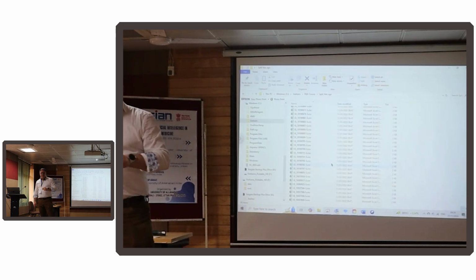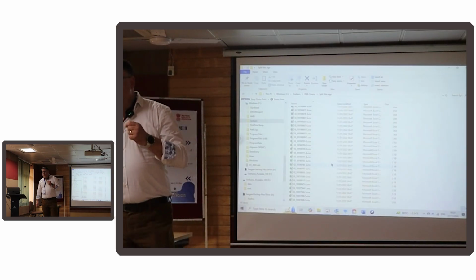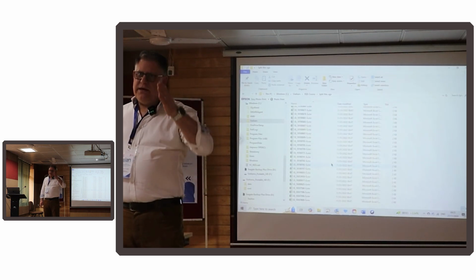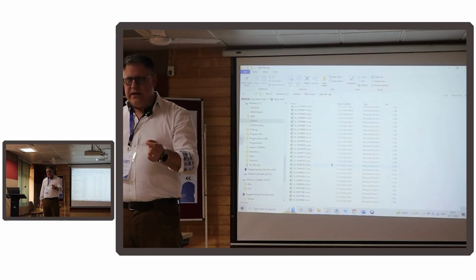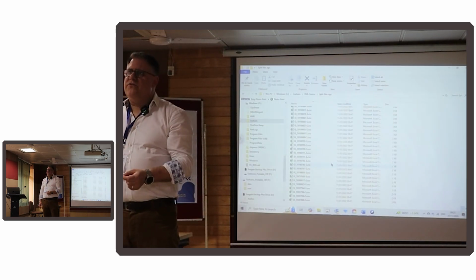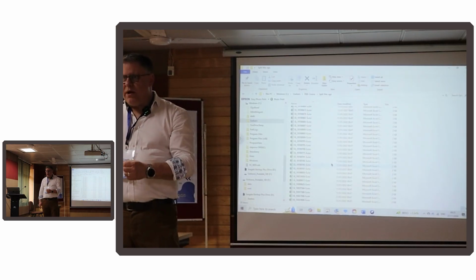Because Weka can't really cope with that in its current form, what I've done is I've basically taken the column header, the gene expression value through the population for a particular gene, and then the state, whether it's young or old. Well, in fact, I think for this I use regression. So it's the absolute age of the person where the muscle biopsy was taken.